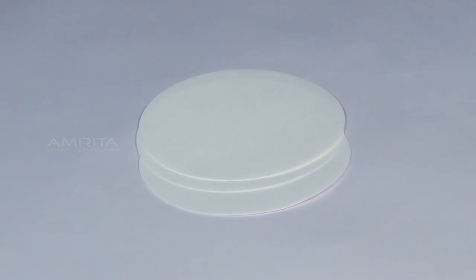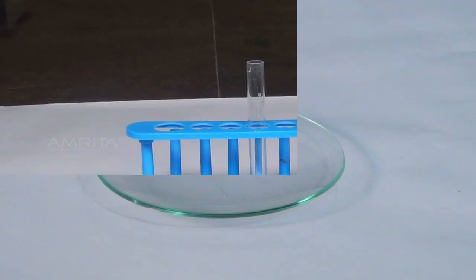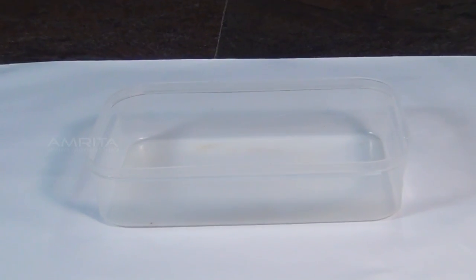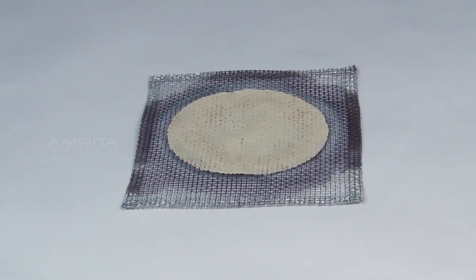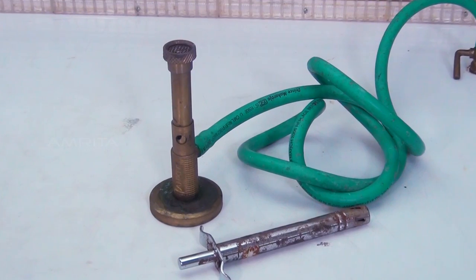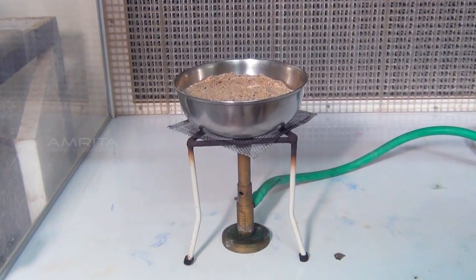filter papers, watch glass, test tube, evaporating dish, trough, stand with clamp, wire gauze, tripod stand, Bunsen burner and sand bath.